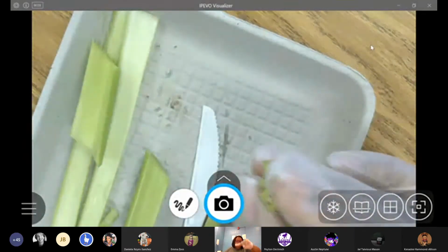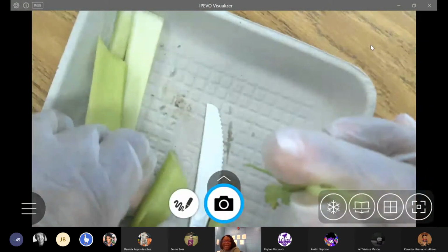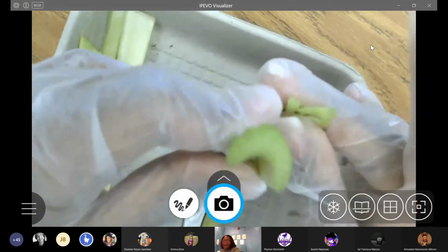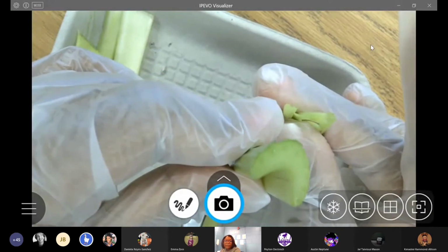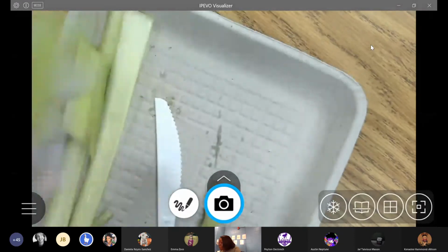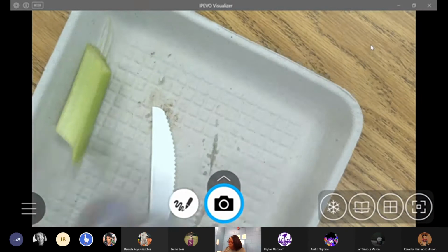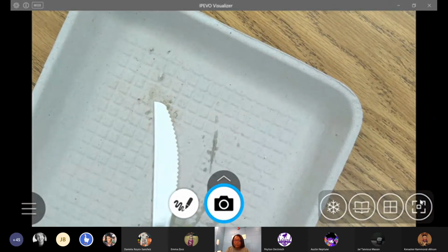Now, it's still going to have some water going to those leaves. It's still going to have some of the xylem, but not nearly as many as we see in our stem. What I want to do now, let's remove some of my pieces here.